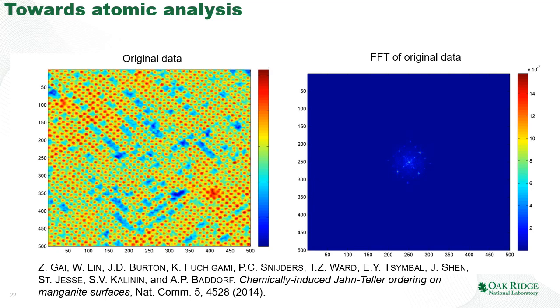In principle, this type of analysis can be done manually, but if you think about the problem of manually finding information even in one image, that will take hours. Think about doing it on tens and hundreds and thousands of images that modern electron microscopes produce per day. So we clearly need to develop automatic methods to convert the image data into the atomic position data. So how are we going to do it?